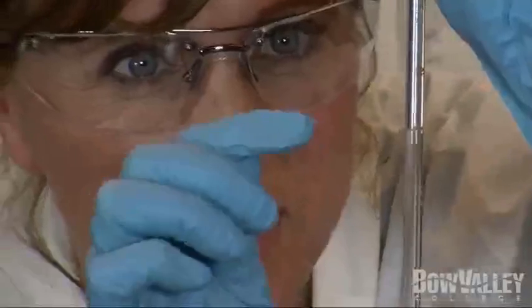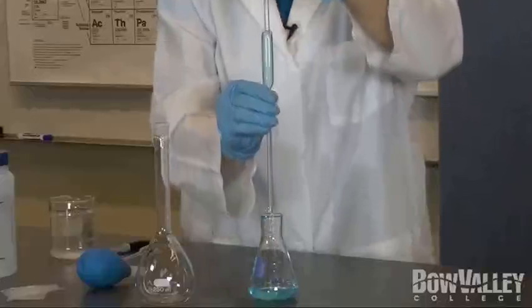If you allow too much to exit, simply use the pipette bulb to draw more liquid in and try again. This takes some practice, so be patient with yourself. Once you have the required amount of liquid, pull the pipette out of the Erlenmeyer flask and insert it into a new 0.250 liter volumetric flask.